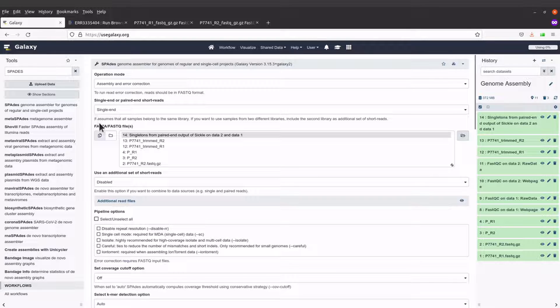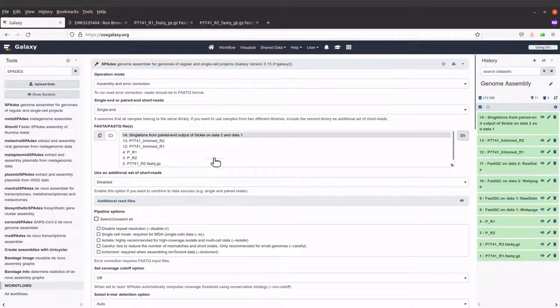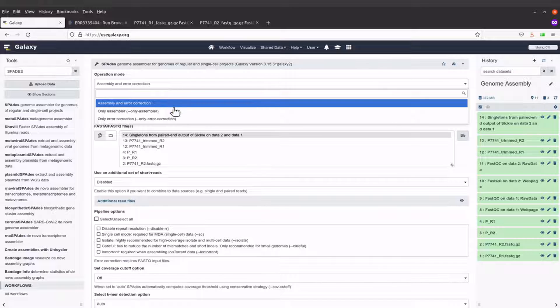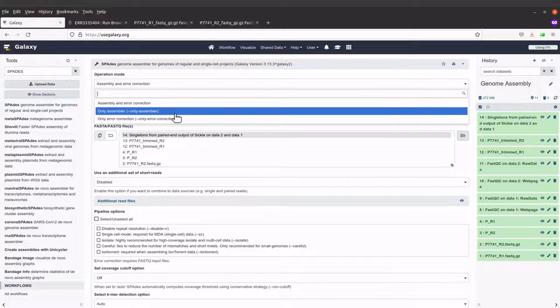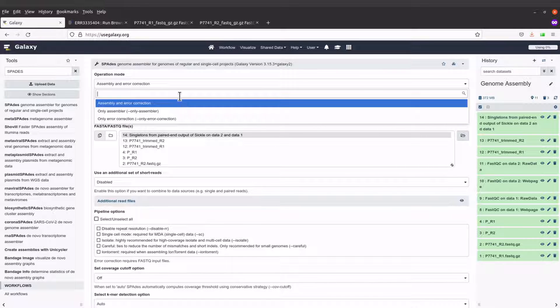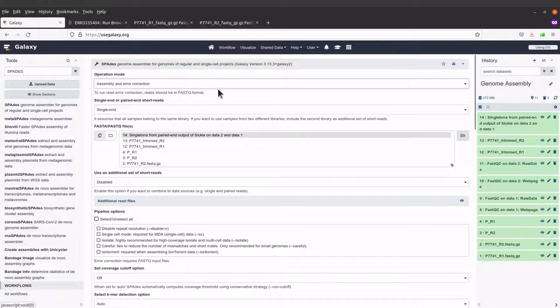After that, I'll have this window showing the operation mode. There are a number of operation modes that we can use, but I'll maintain the first one, which is assembly and error correction.